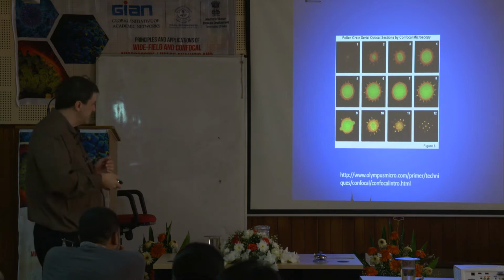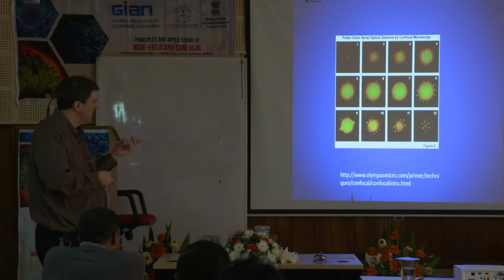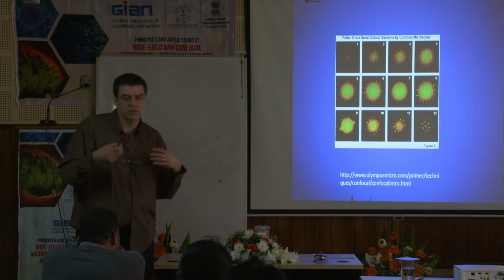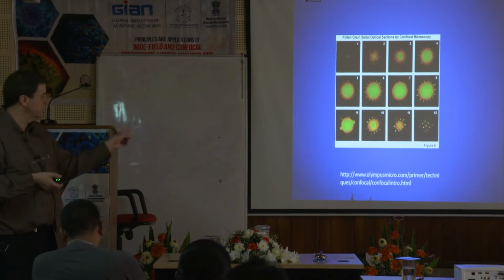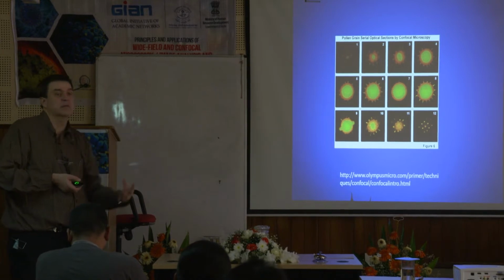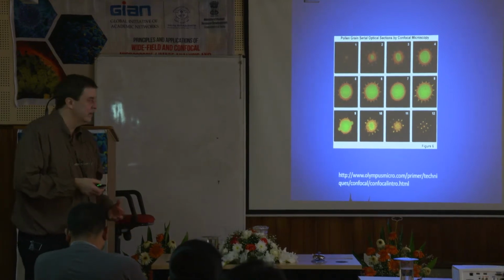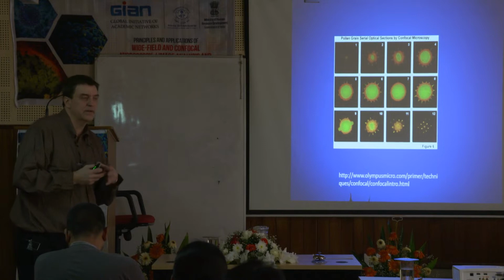Okay, I think I talked about this earlier the other day. This Olympus Micro website is a really good website. It explains this stuff, and it also has a very nice explanation of what we're going to talk about a little bit, co-localization. I know a lot of you mentioned in the questions I put out there, those cards, that you want to do co-localization. So I would definitely look at this Olympus site and the Nikon microscope site. Both have very nice explanations of co-localization that go beyond what I'm going to teach you today. If you want more information, there is literally a ton of stuff out there on the net. At the end, we'll talk about the 4 big microscope companies, but their websites are very nice, educational, and very well done.